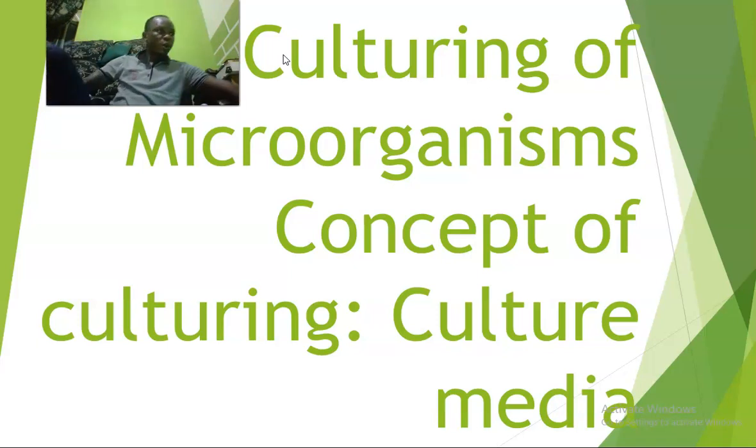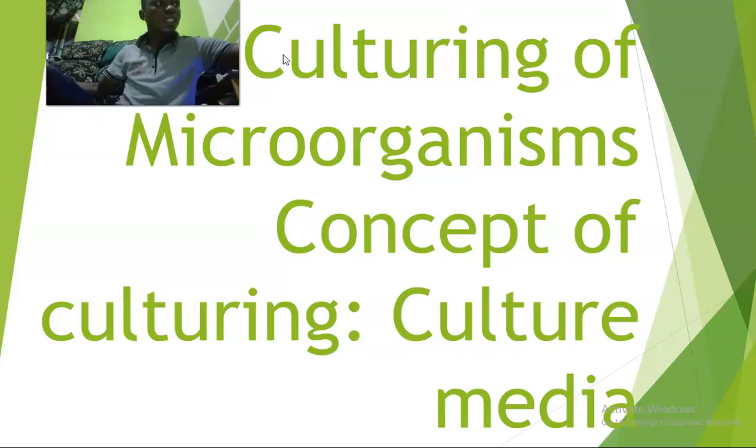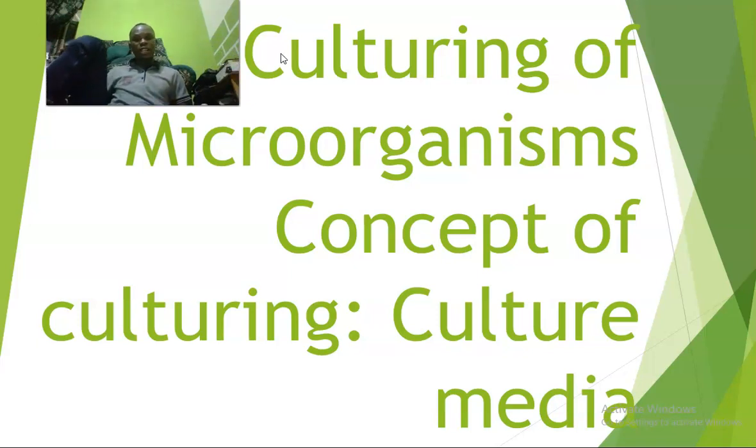So today we'll be looking at microorganisms and how to culture them. That's what we are learning today, how to culture microorganisms. So let's move on with the slide. You'll be able to understand some concepts of this culturing of microorganisms.